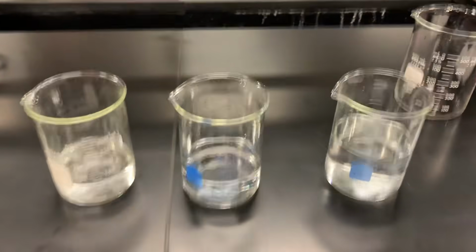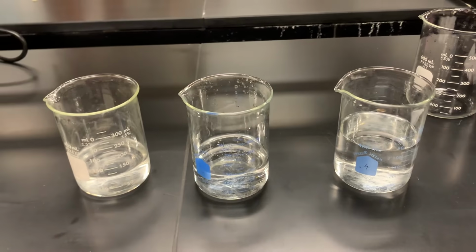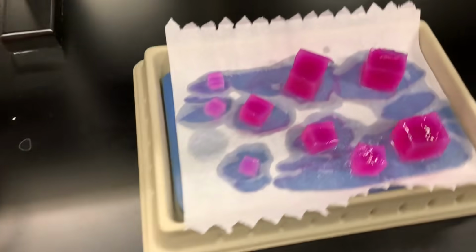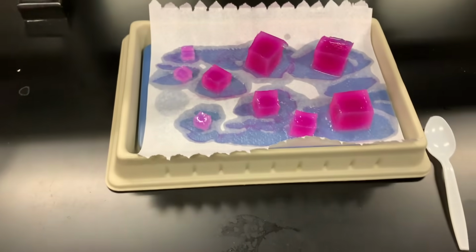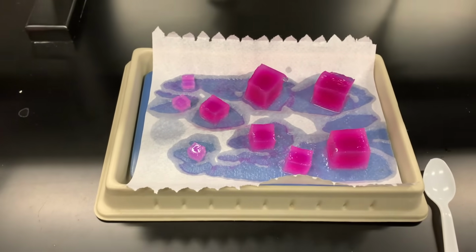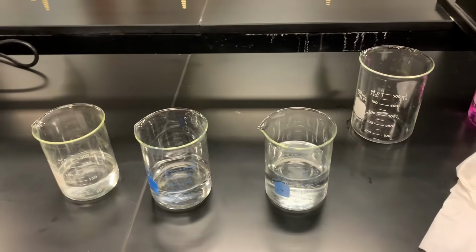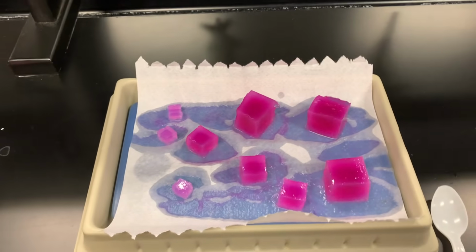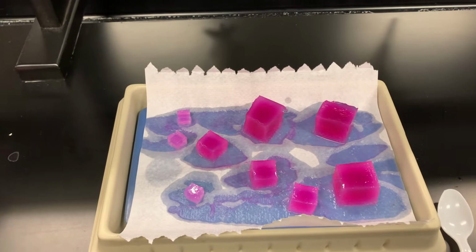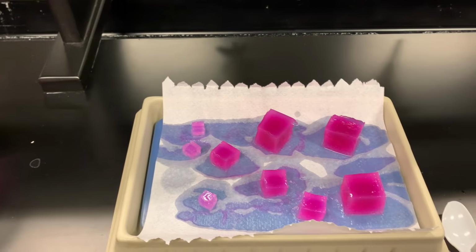So what I did now is I prepared 3 different beakers full of 1 molar hydrochloric acid. So phenolphthalein, whenever we have a base present, it's going to show that pink color. Whenever we put it in an acid over here, what's going to happen is that color is slowly going to leave because the acid is going to take away that base. We're going to pretty much neutralize it.